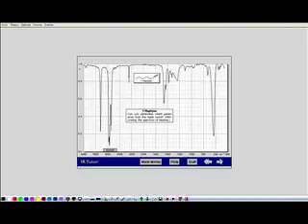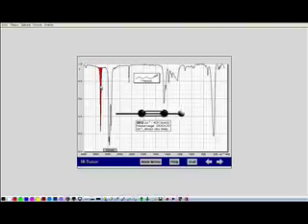Okay, carbon-carbon triple bond then. Well, there are two types of carbon-carbon triple bonds. There's what's called an internal alkyne and a terminal alkyne. You'll talk about this in lecture, but the terminal alkyne is the one that has the CH bond at the end. And if you have a C triple bond, CH bond, it shows up very sharp at about 3,300 wave numbers. And that is the stretch. It has a moderate intensity to it, but it's characterized that it's very sharp when you see that.